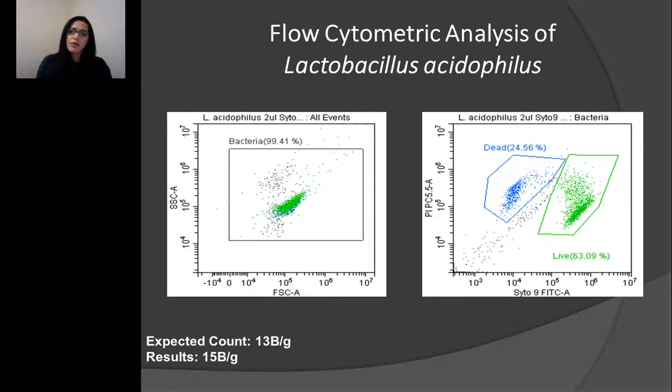Some of them might have a thicker layer of cryoprotectant than others, and therefore it can be a little more challenging for sample preparation or the cell staining process.